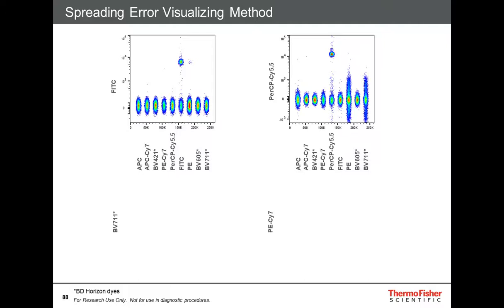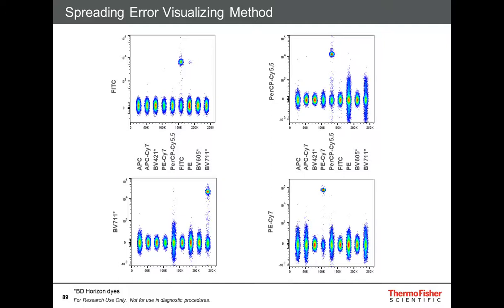So I know that if I'm going to use an antibody in Per-CP Cy 5.5, it has to be brighter than that 10 to the 3 point, because if it's dimmer than that, I just won't see it in multicolor space unless I use it on different cells than I'm staining with the PE and the BV711. And our new super bright dyes that also emit off the violet channel would have the same characteristics because they have the same or very similar emission spectra.